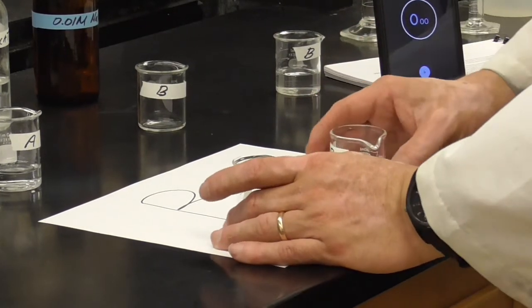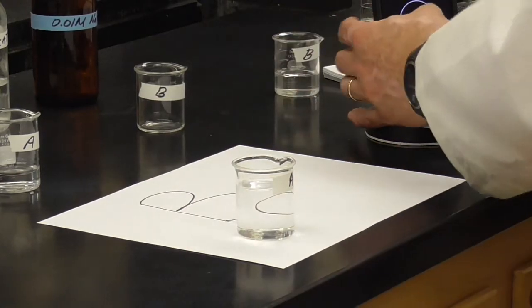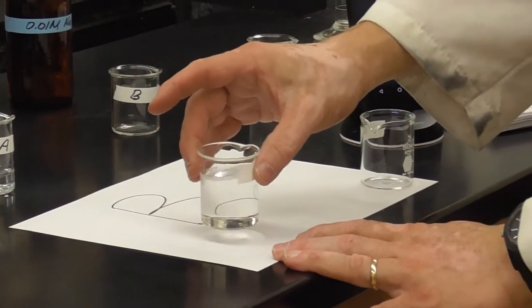Okay, once again, we'll do the same thing. Add the B to the A. Start the timer. A little mix.